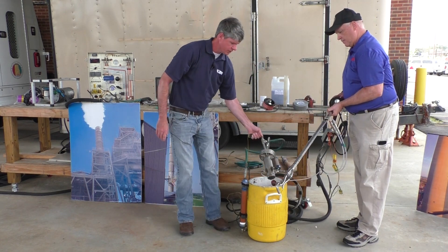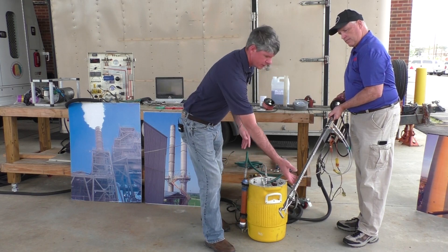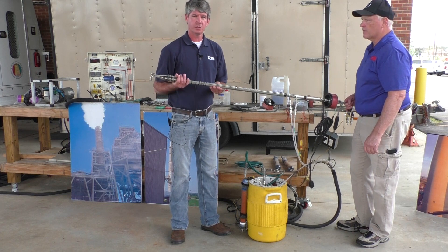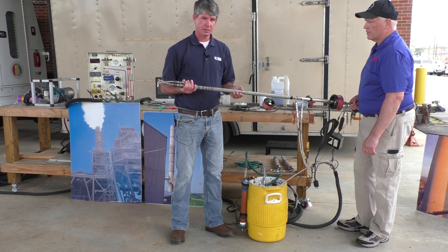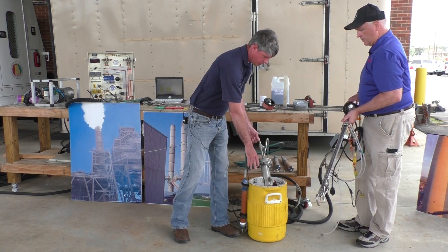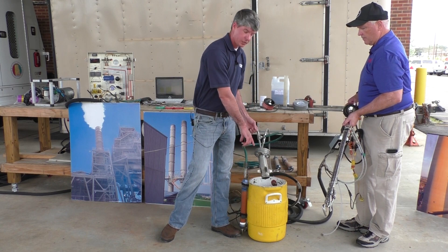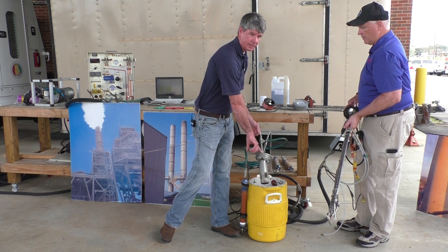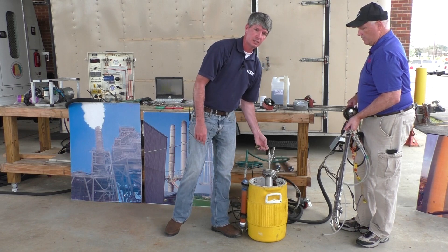Then we have the condenser, and this is a moisture knockout. The way this works is our probe and filter are kept at around 250 degrees, which is above the boiling point of water, which is 212 degrees. Then when the sample runs through the condenser in our cooler, which is in an ice bath, the moisture is knocked out. It goes from a gas phase in the probe to a liquid phase in our condenser.